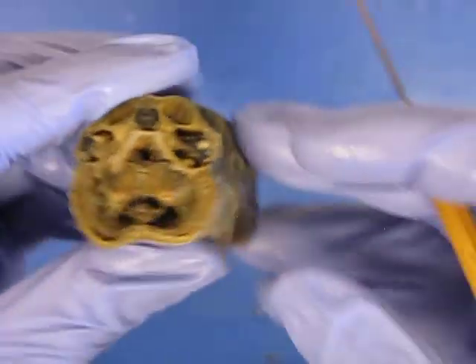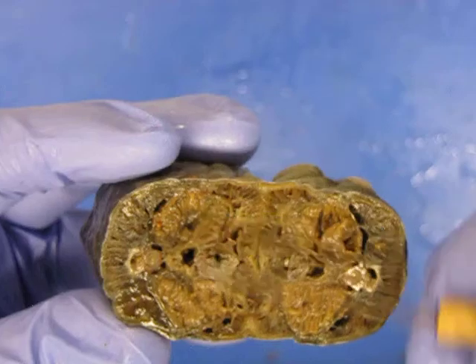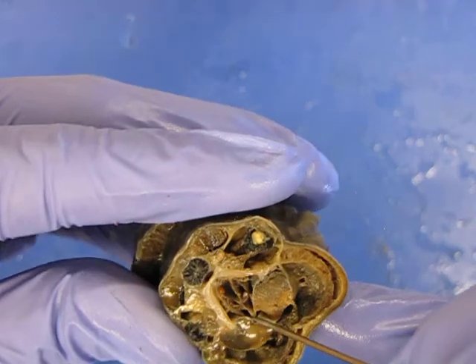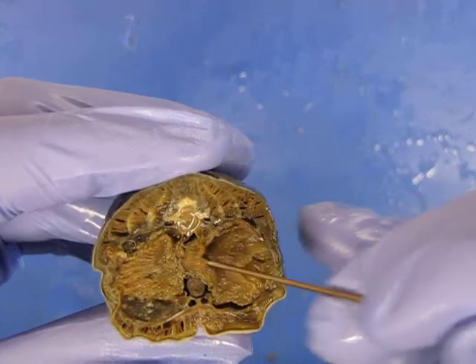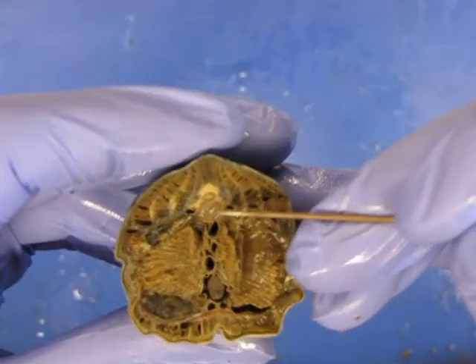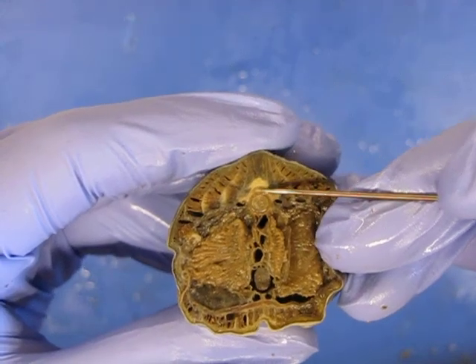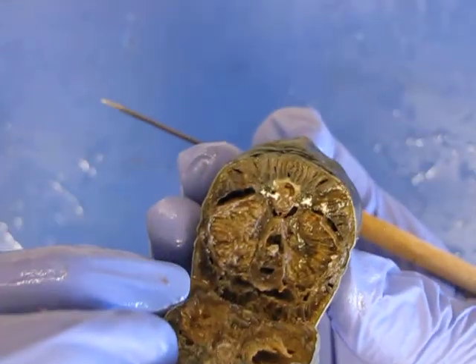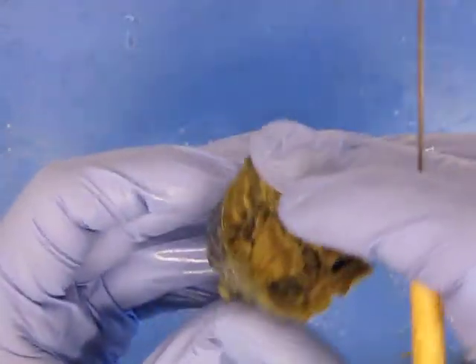Muscle there. Okay, so from there, you can start to see the gills here, which means that pharynx is now separated into esophagus and pathway to the gills. Gills. Now you can see the notochord. You can also see, just dorsal to the notochord, this start up here. This little area, that's going to be the spinal cord, which means the brain looks like it's right here. See how I just kind of traced that back and decided how far it went?